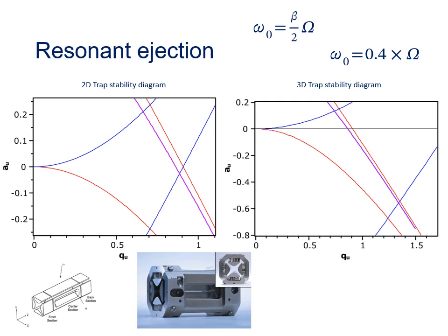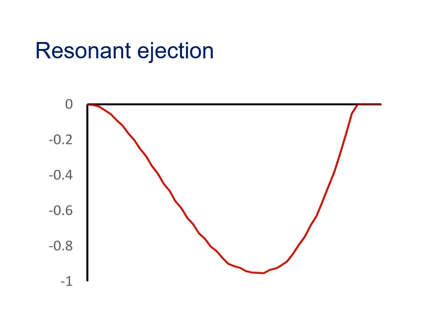So to recap, the first benefit of using resonance ejection in ion traps affects only linear ion traps. By putting the extra tickle signal only on the X rods, we guarantee that those are the rods that the ions will be ejected through. The second benefit of resonant ejection affects both kinds of ion trap.